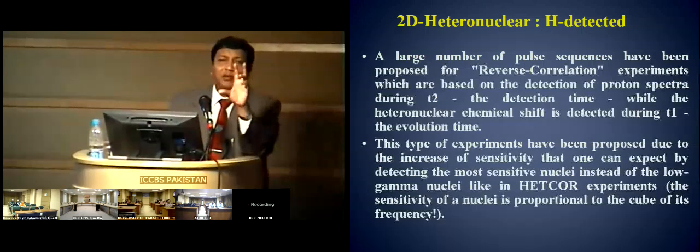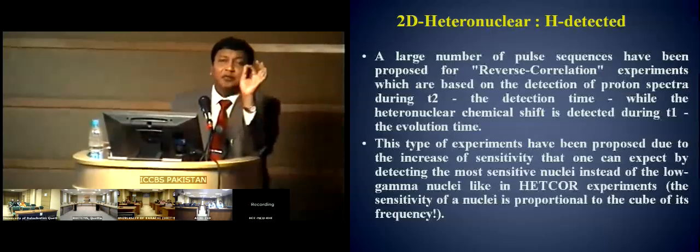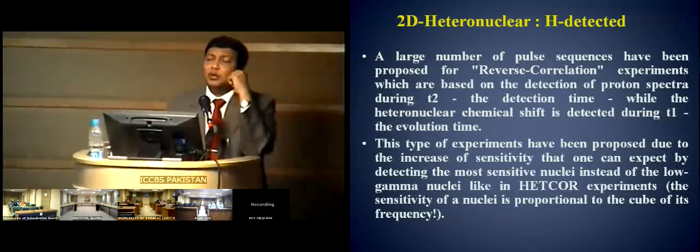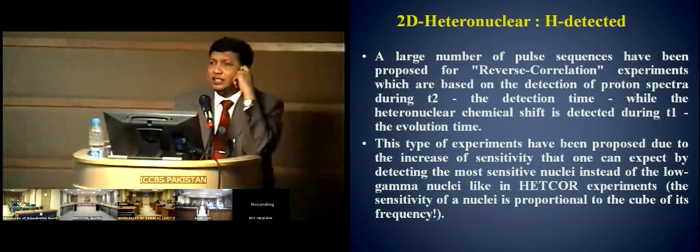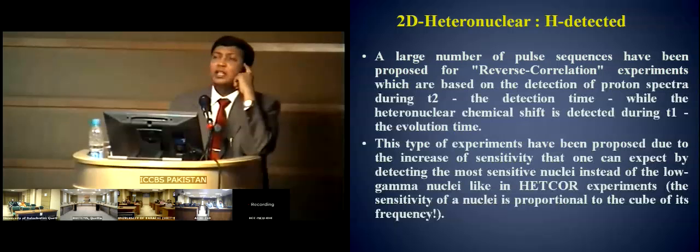And then you have this very funny, interesting pulse, which takes the antiphase doublet of proton and brings them on Z and negative Z. Always remember, this is the key of everything. And then you transfer the polarization from proton to the carbon. So the source nucleus is proton, and the detected nucleus is carbon. As a result, you see an intensity enhancement, a sensitivity increase in it.